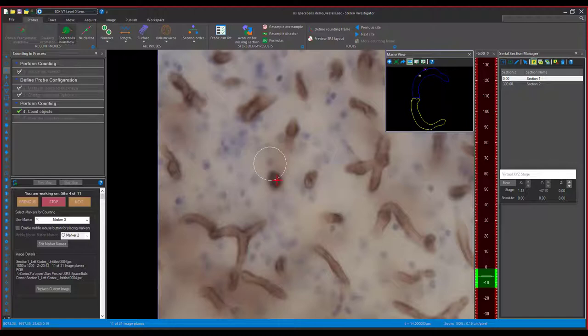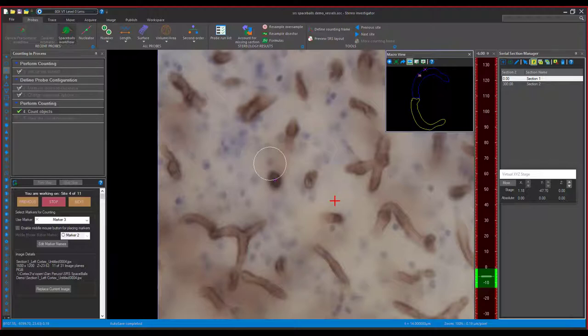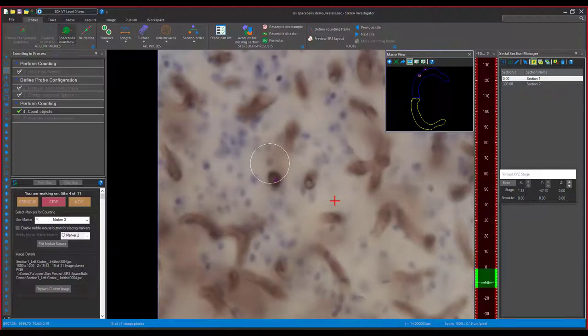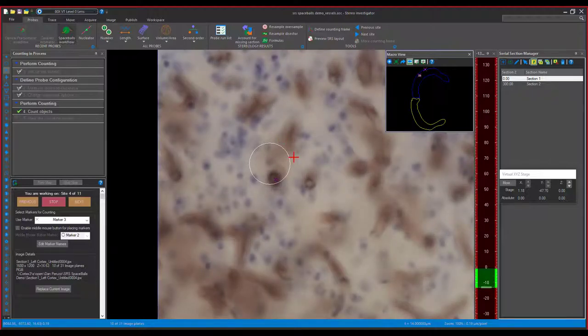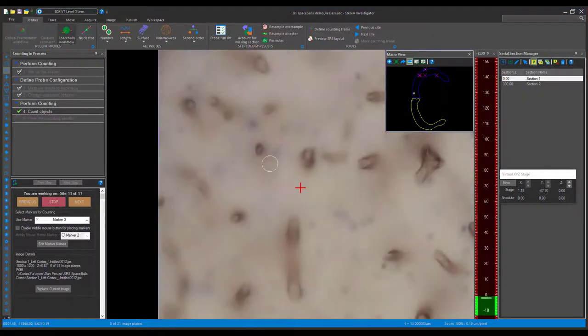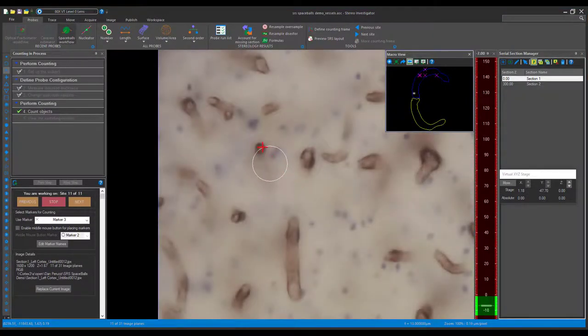Here, we can see the middle of the blood vessel cross the sphere, allowing us to place a marker. No other vessel crosses or touches, so we move on to the next counting section. We do this until all random counting sites have been visited.